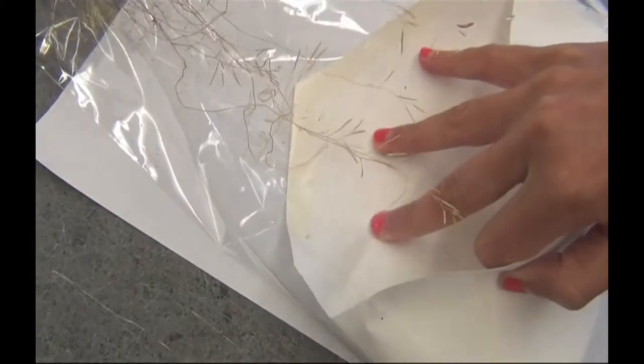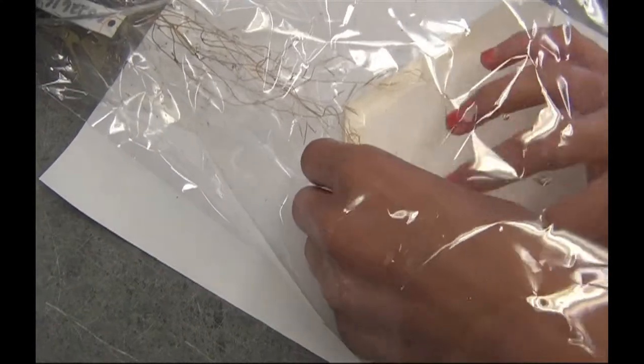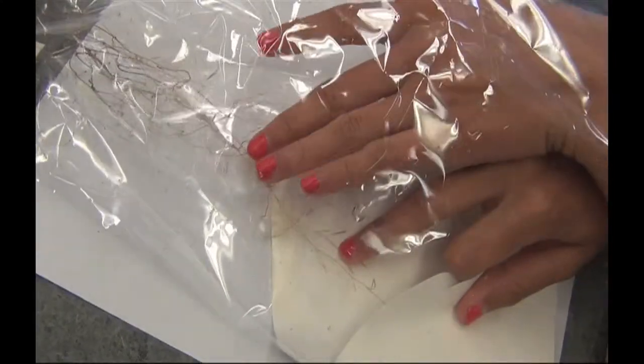At Barnard, we lay our plants down on the bench and place an open envelope into the sleeve. We then knock the seeds down into the envelope.